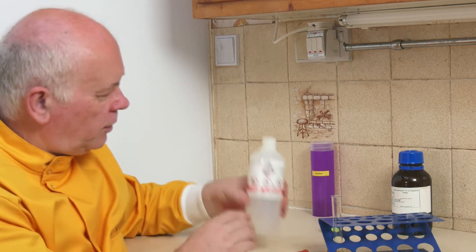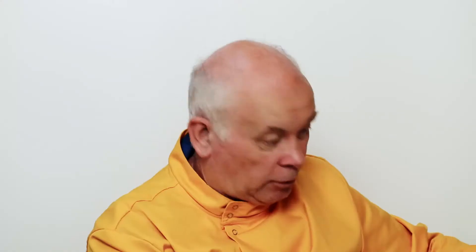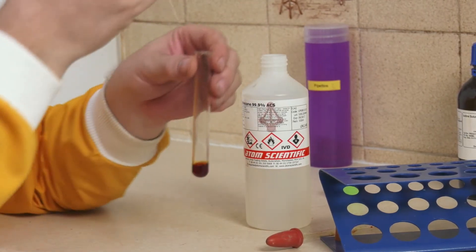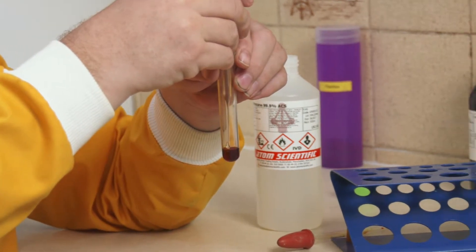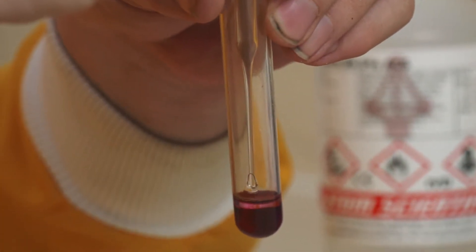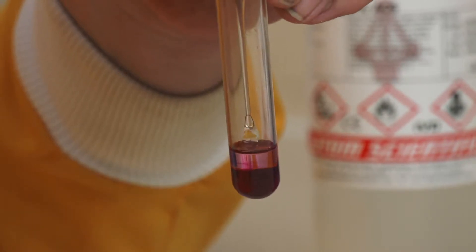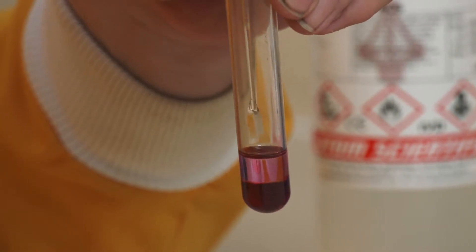This is particularly nasty stuff — it's harmful to the environment, it's inflammable, and it won't do you an awful lot of good if you drink any. So we're going to take some of this cyclohexane but I'm going to try and put it down very carefully so that I float it on top.